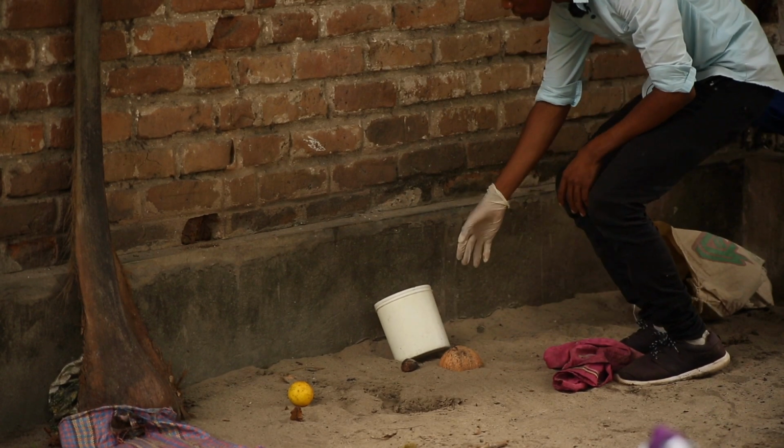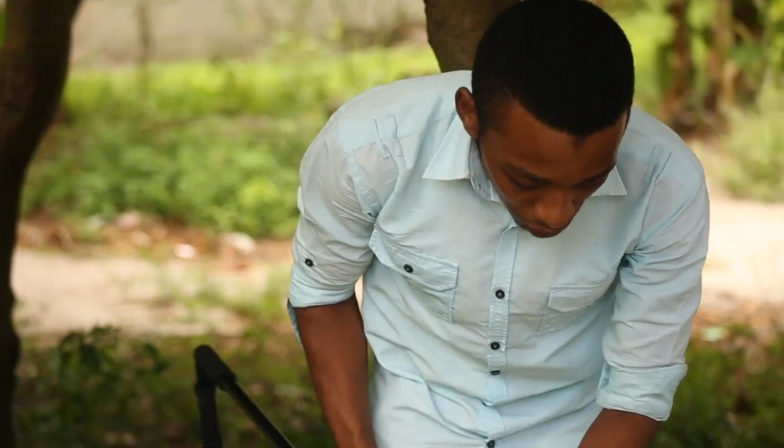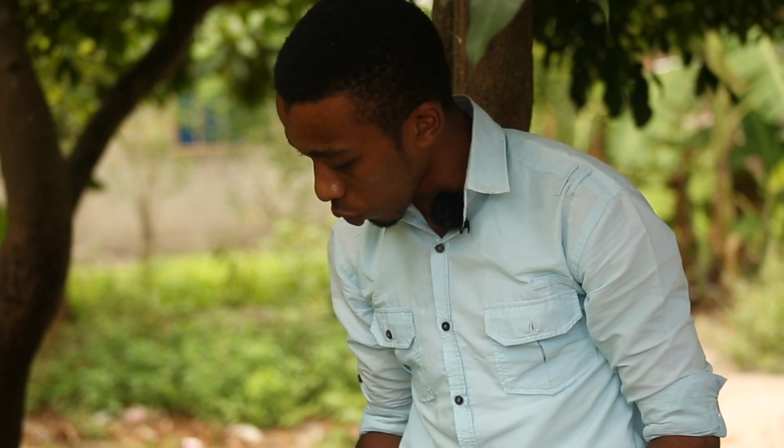So right here we have an extensible dipper that we use to reach for water, pipettes, and a vial for storing the larvae that we collect from our breeding source.